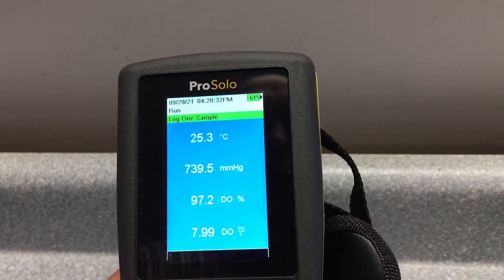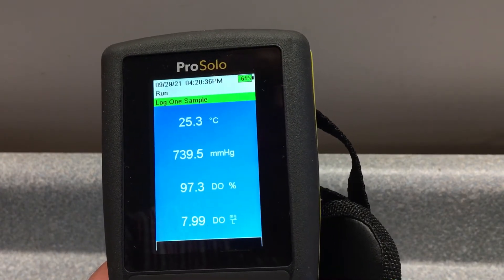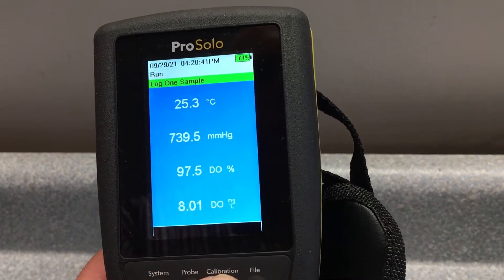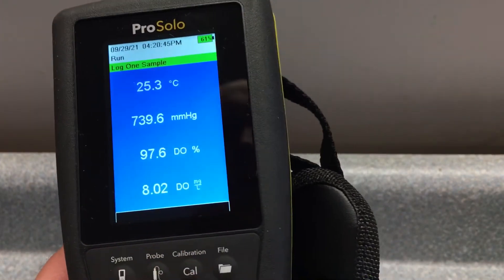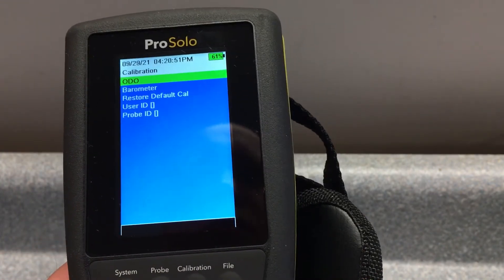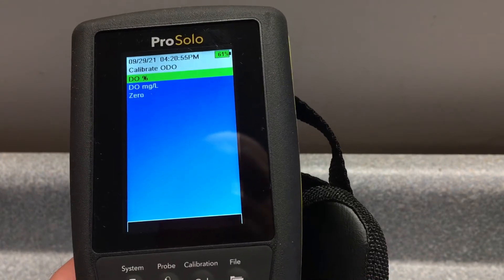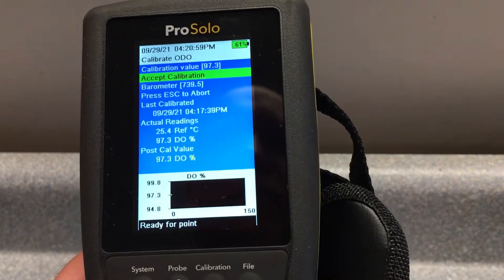For the calibration, just make sure that the sensor ODO cap is blotted dry. Let it equilibrate in the calibration sponge chamber. Then hit calibration ODO and calibrate in percent. It says preparing for calibration.